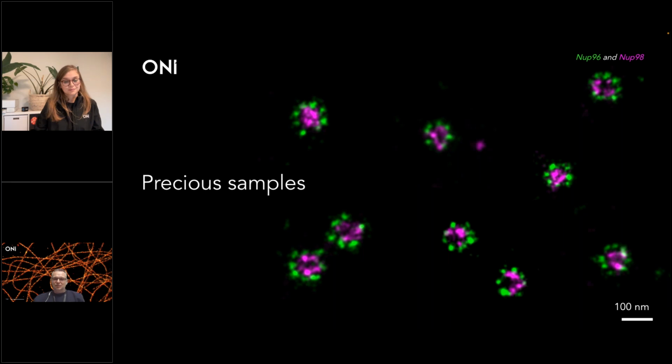If you are using ImageStream, then the resolution is very poor, because it's basically a snapshot of each cell running through. It's a very good high throughput method which can separate cells by whether they are expressing the protein or not. You can use sorting. But high resolution will give you information about the position of your protein.